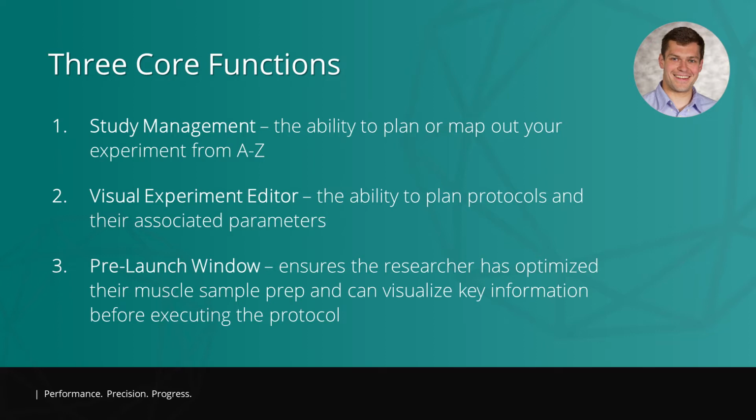And the third and final function is this idea of a pre-launch window. We call it in the software the prepare experiment window. This window is going to ensure that the researcher is able to go through the steps to optimize their animal or their muscle sample in a way that is in keeping with standard practice.